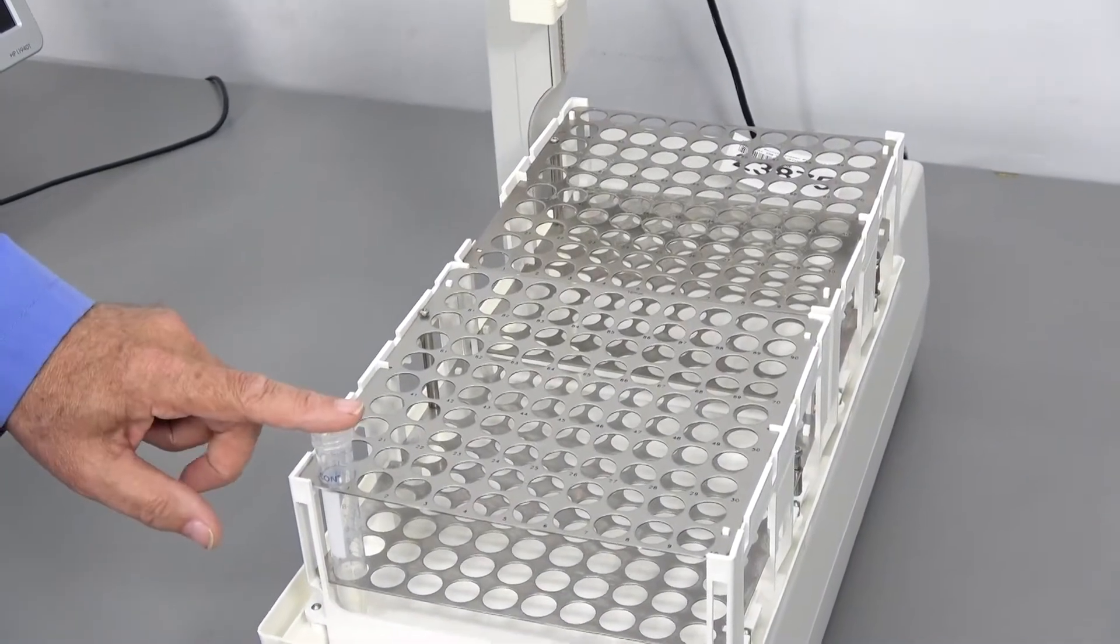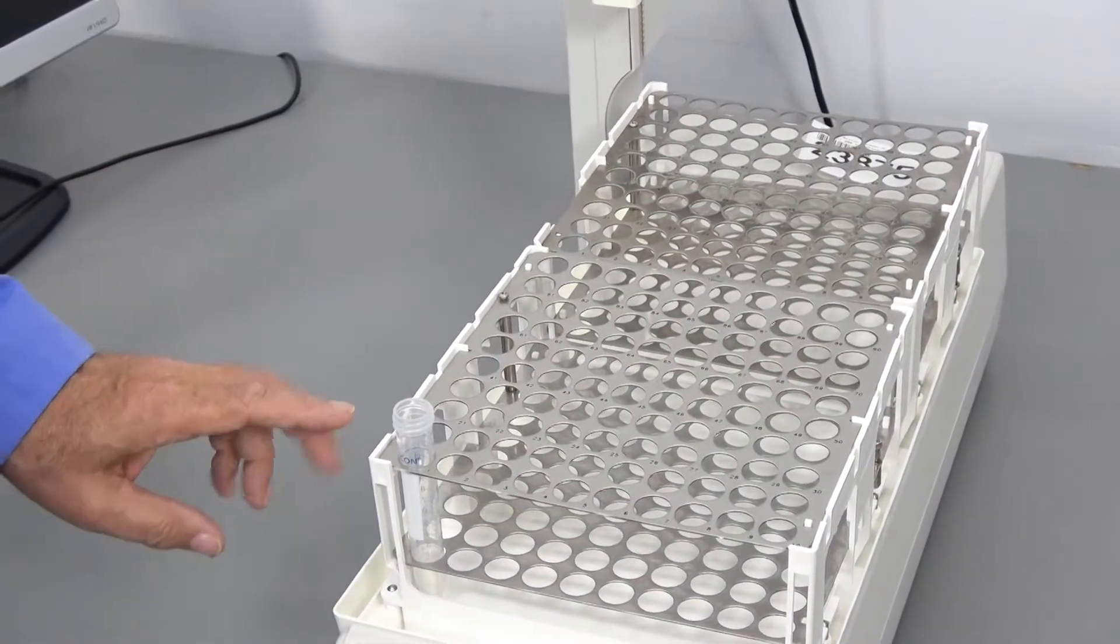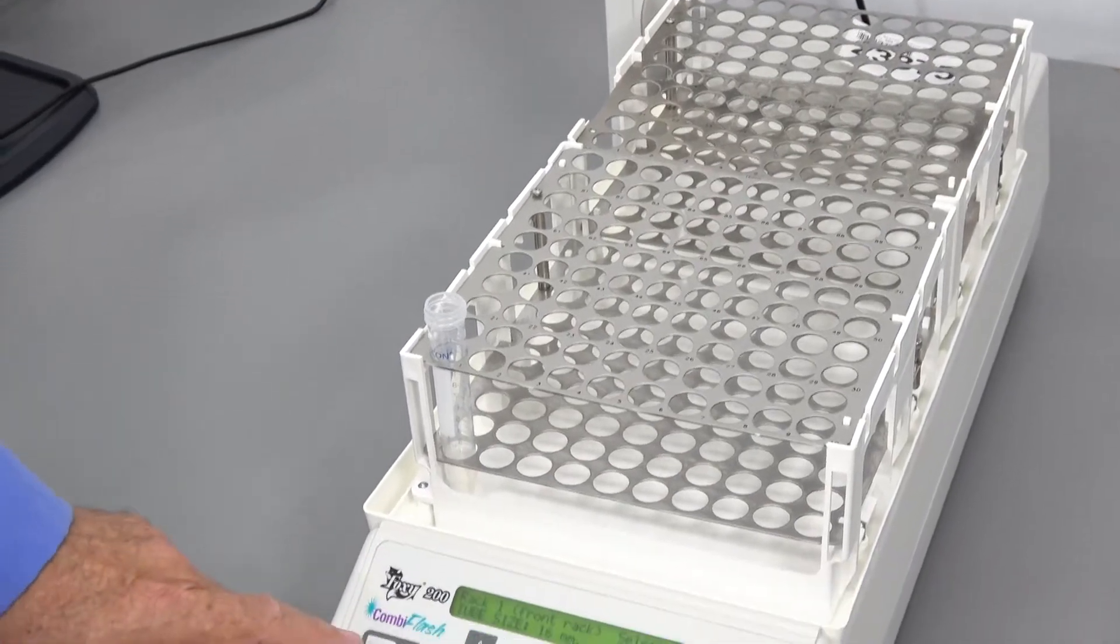We're using, these are 16mm racks. Other sizes are available and they are programmed into the system.